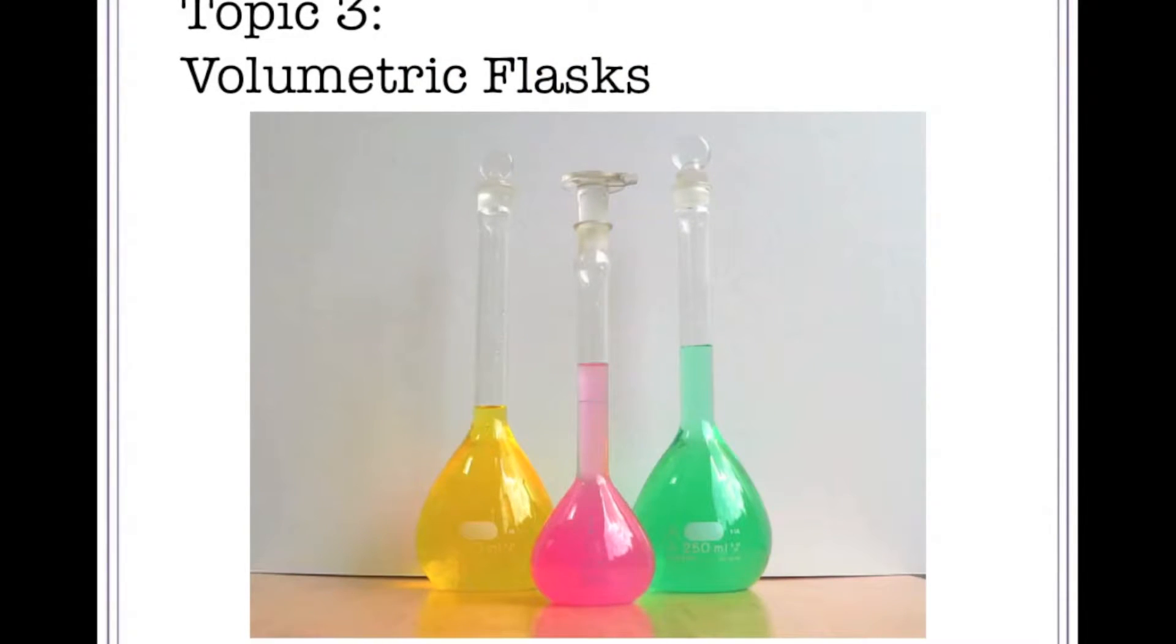A volumetric flask is used to prepare solutions to a fixed volume very accurately. The mark on the neck of the flask corresponds to the correct volume reading. Next we will demonstrate how to prepare a solution using a volumetric flask.